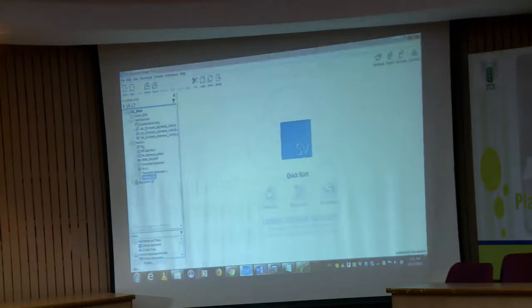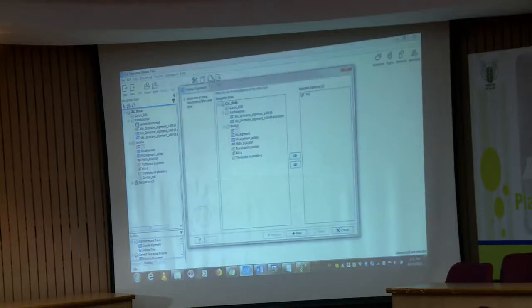Earlier I had imported some file over here. If I import that file, this format will come, okay. The red icon, the red bars will be coming. So, for making the multiple alignment, I will select this, go to this and create alignment, okay. Now, this has already been selected, whichever each gene, one file will be generated, right.